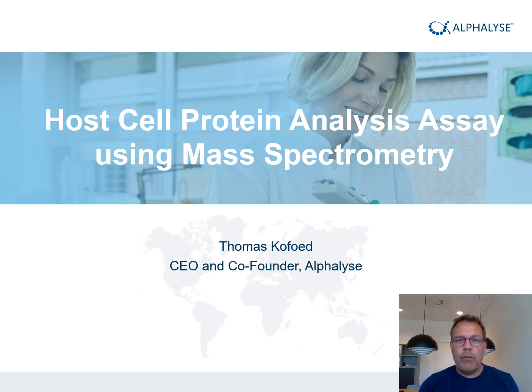Today's webinar will very much focus on the assay we have developed here at Alphalyse over the last 6-7 years. We spent quite a lot of time developing this assay, and I want to go into detail with that. Applications will not be mentioned so much. If you want to look into applications of this assay, you should look at our website. We have other webinars about that.